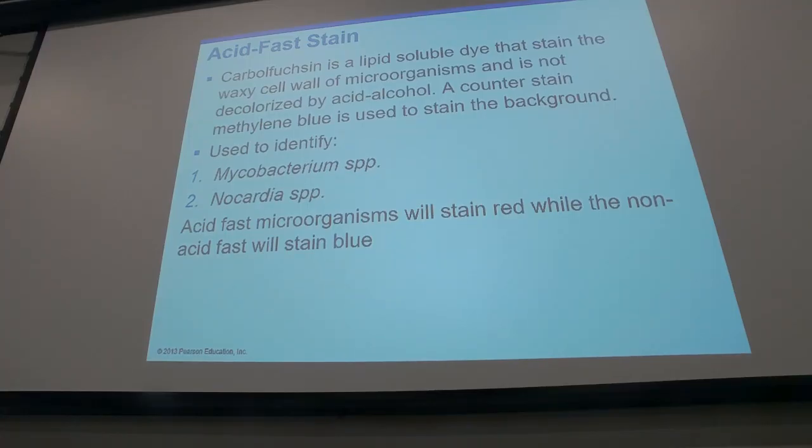And then you put your sample, your smear, on top of boiling water. You put filter paper on top of this, and you will be adding first carbolfuchsin for 5 minutes as this water is vaporizing under the glass slide. That is going to warm up your specimen, and it will open the wall of the bacteria. Because this bacteria typically has a very thick layer, like in the case of Mycobacterium, of a substance that's called mycolic acids. It's like a waxy material. The dyes don't penetrate as easily, so you don't use gram stain.